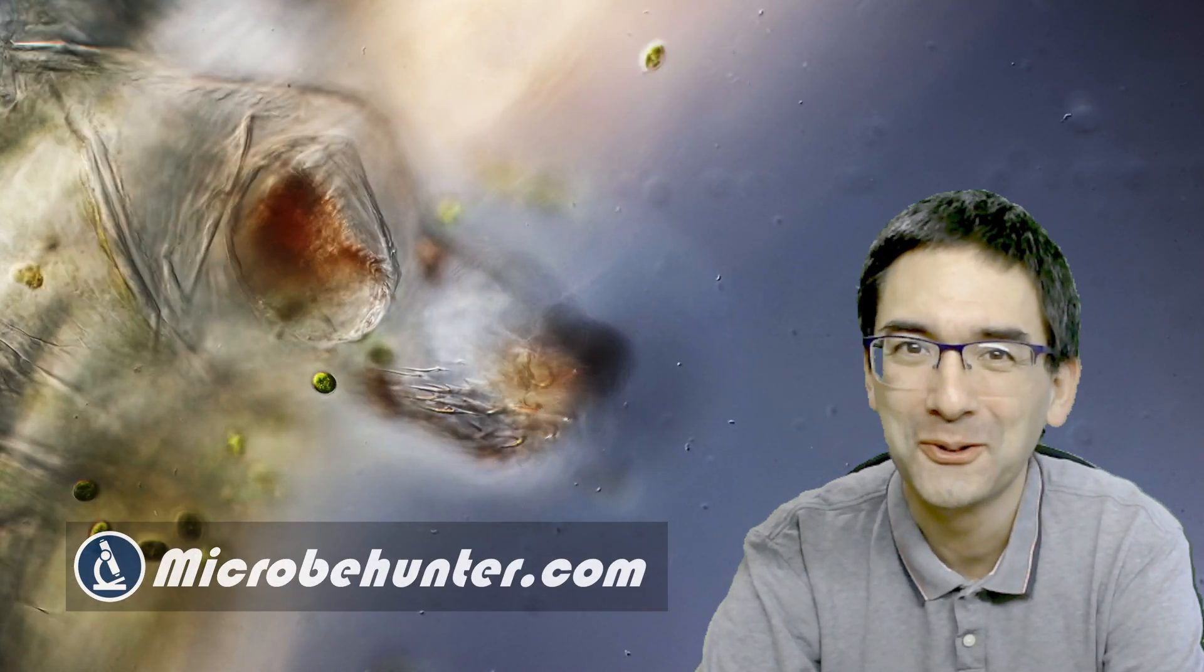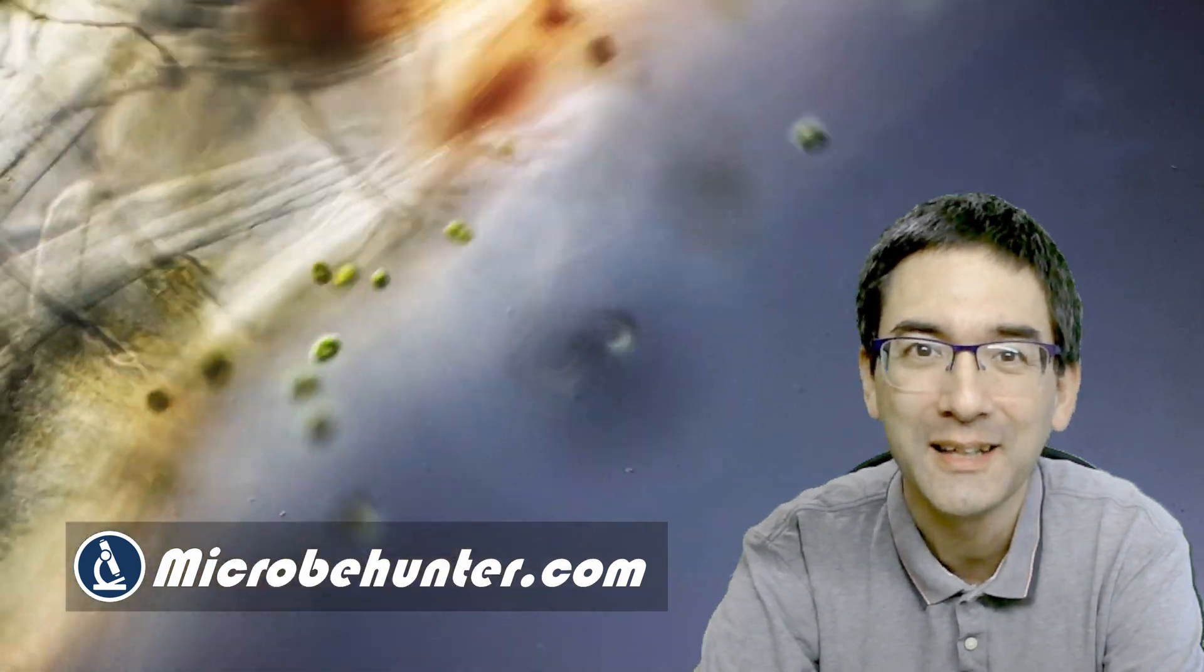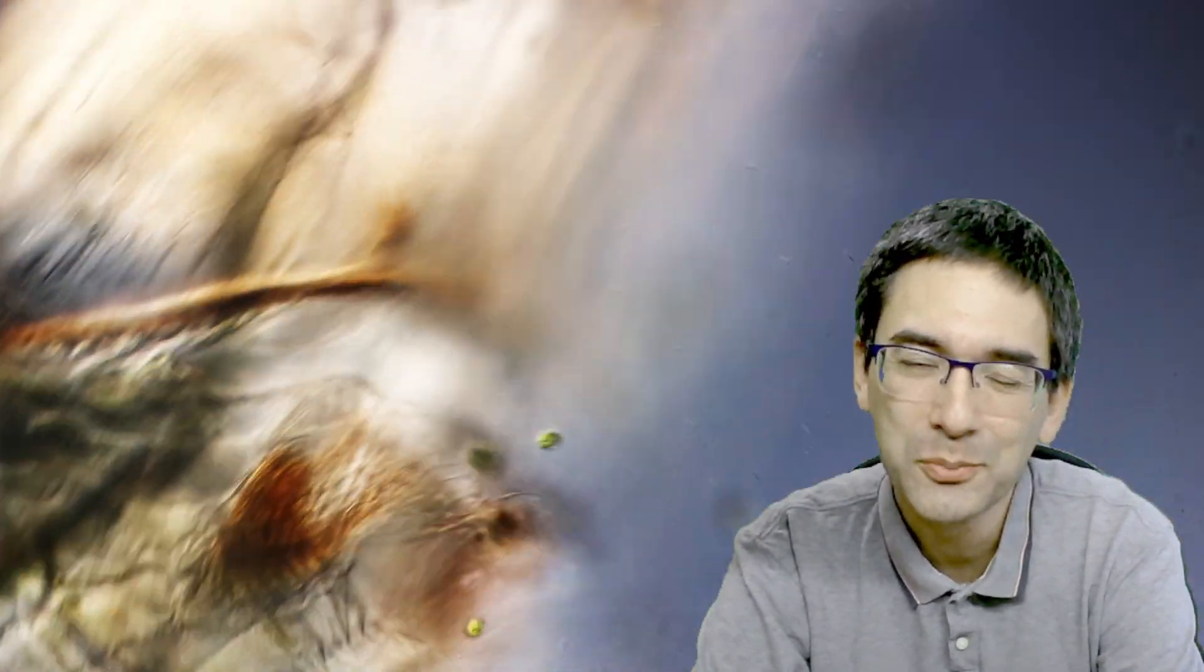Hi, hello and welcome. Microbe Hunter here again, and today we'll have another look at an interesting specimen. This one here is the larva of a midge, a midge is a fly, and specifically today I'd like to look at its feet.